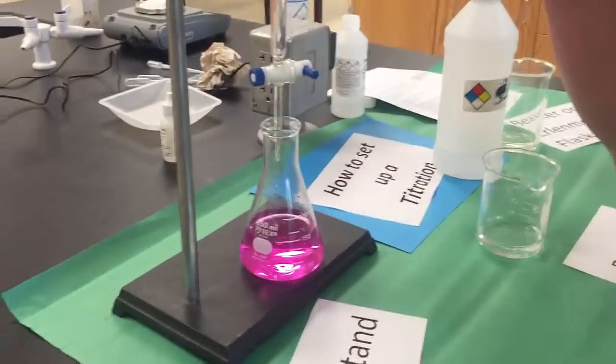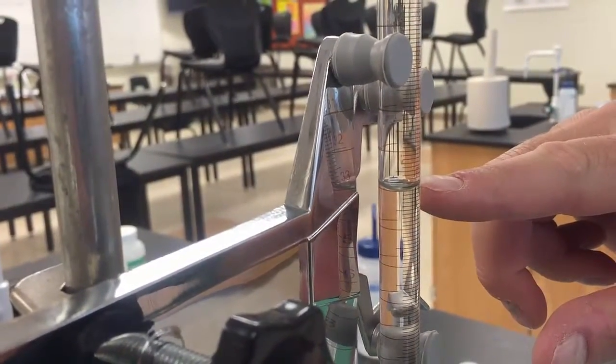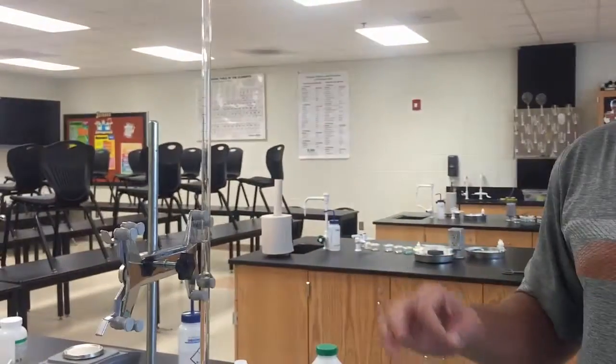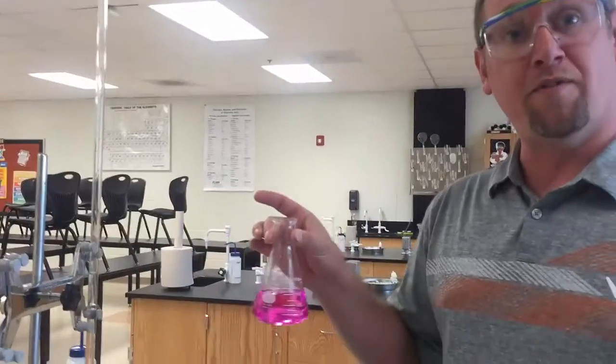Here's what I learned. If I focus in here, I went from 2.4 down to about 33. So I put in 31 milliliters, give or take, of sodium hydroxide. I know now that if I do the exact same amount of KHP, I won't need more than 31 milliliters. So I know kind of that range, so I can put in 25 and then go slow and figure out where exactly. So it saves you a little time to do that really rough estimate first.